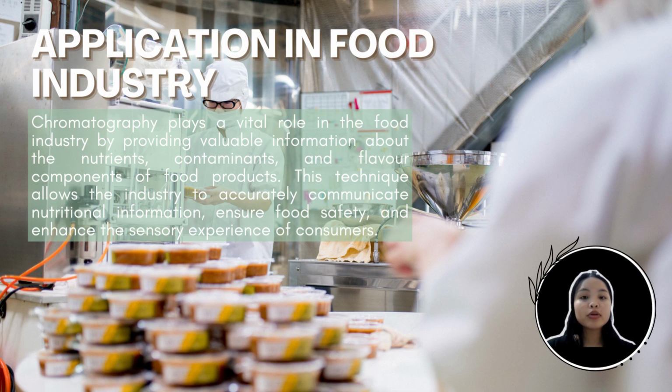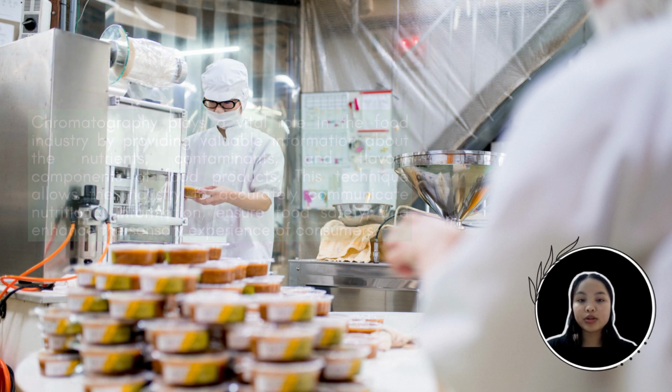Hence, chromatography plays a vital role in the food industry by providing valuable information about the nutrients, contamination, and flavor components of food products. This technique allows the industry to accurately communicate nutritional information, ensure food safety, and enhance the sensory experience of consumers.